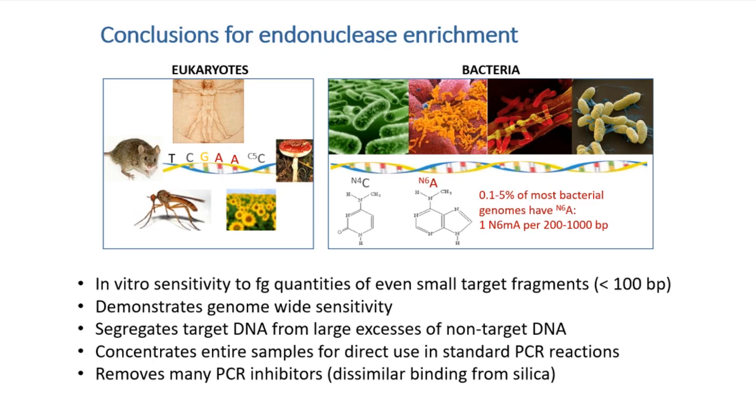First, I should point out that in the eukaryotic kingdom, the signals in the DNA world are A, G, C, T and methylated C. You have other signals in the bacterial kingdom. So this gives you opportunities to choose your signal and noise, especially because there are over 300 restriction endonucleases out there. That gives you a lot of options for what you want to bind and not bind using these kinds of approaches.